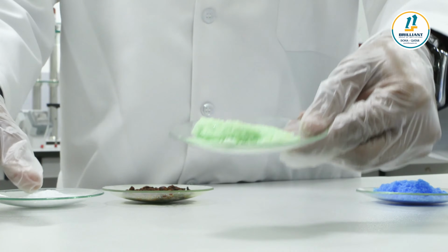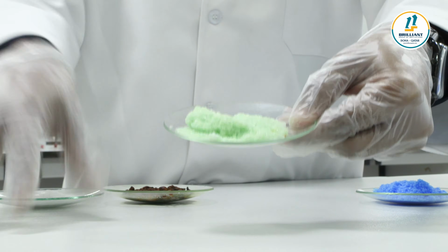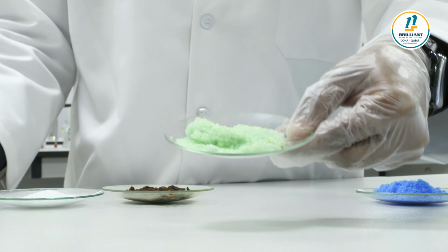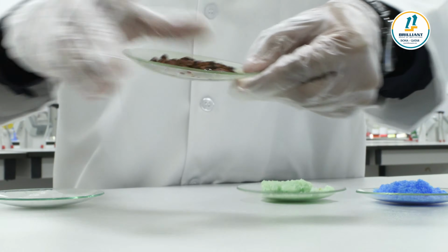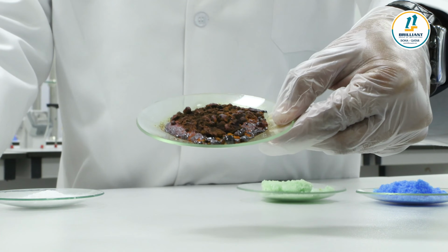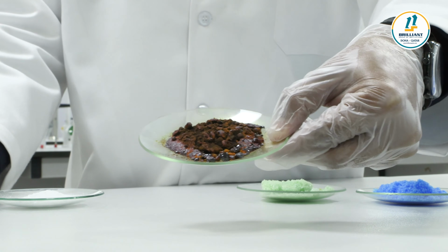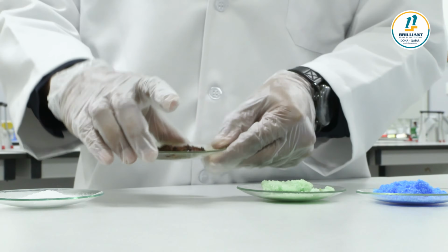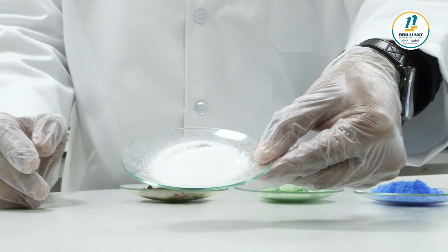Another one is a pale green color. You can see the pale green color. A pale green color indicates the presence of, maybe, a ferrous salt. What is ferrous? Fe2+, right? Ferrous salt. And this one has a brownish color. The brownish color indicates that it may contain ferric. What is ferric? Fe3+, ferric. And dear all, mostly they will give you a colorless salt for your examination.